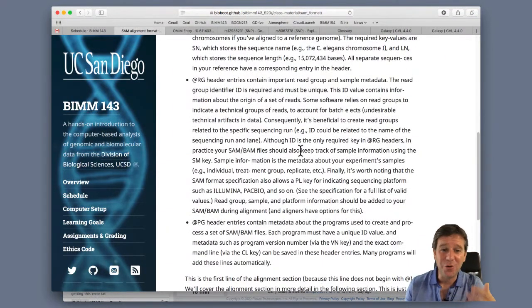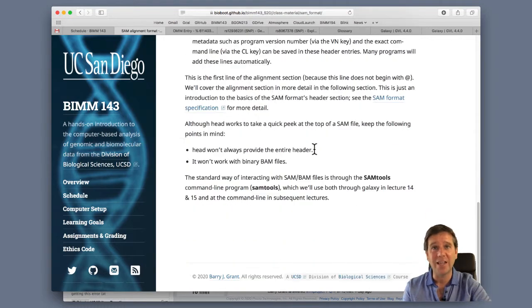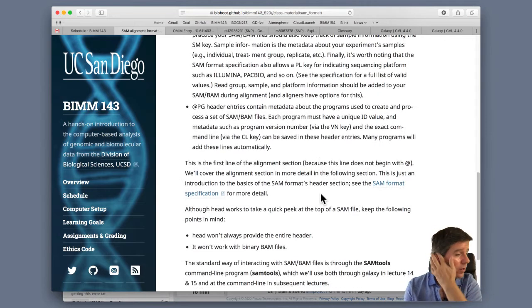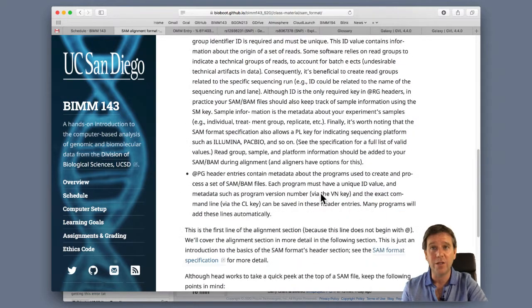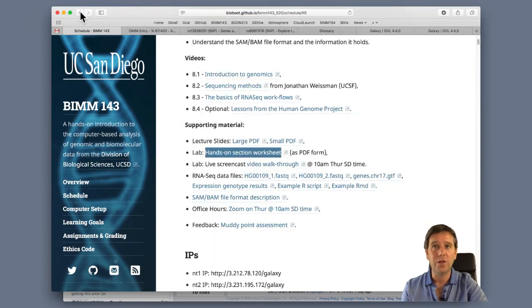Generally speaking, we don't really need to look at this yet, and actually, I rarely do look at it. We read it into genome browsers or other viewers. We're not going to edit this by hand, for example. There is a set of tools called SAMtools, another program that is really good for manipulating these types of files, and we'll often do it through there rather than editing the file manually. So that's all there for you if you're so motivated to read it.